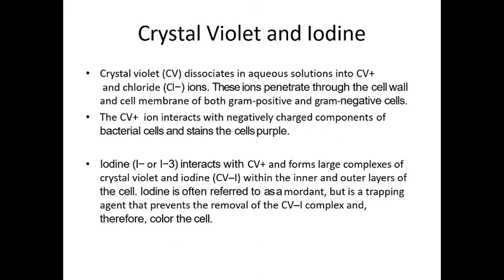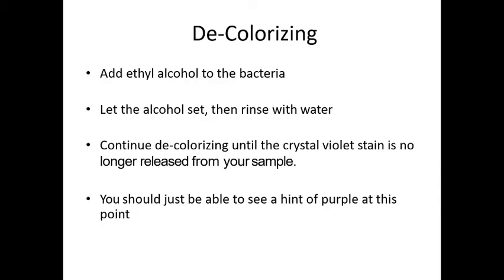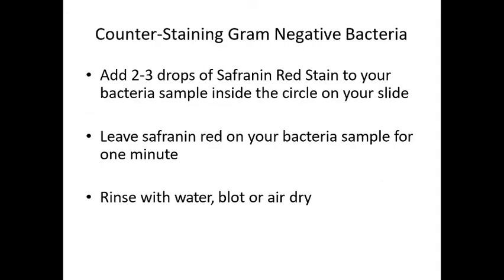So that's the basis of the experiment, and when you want to decolorize the excess stain that has been added, you add ethyl alcohol to the slide. So when the ethyl alcohol sets, it reacts with the crystal violet stain, and hence the excess stain that is not absorbed on the bacterial surface is washed off.